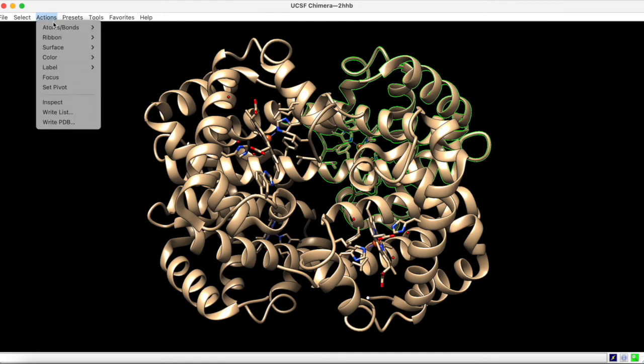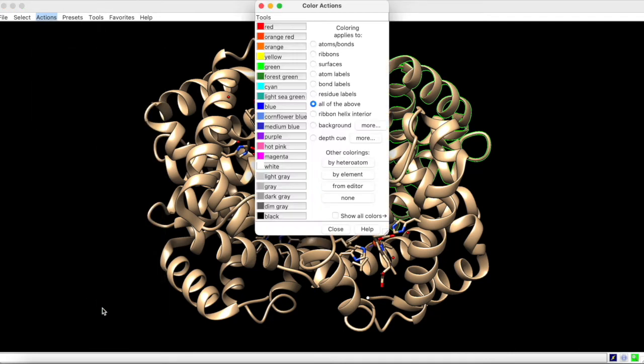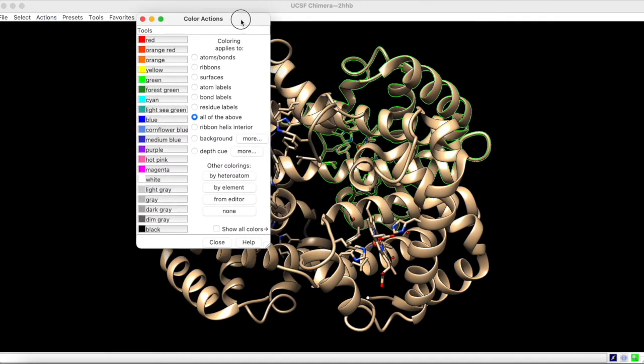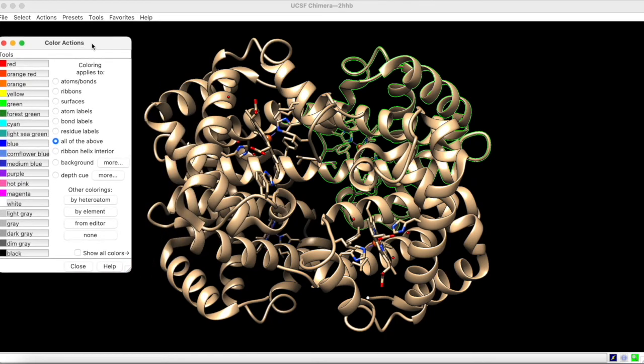Under Actions, we can color this chain however we want. Notice that coloring can apply selectively, but defaults to all of the above. To selectively color the ribbons, we can choose this option, and a color of choice.